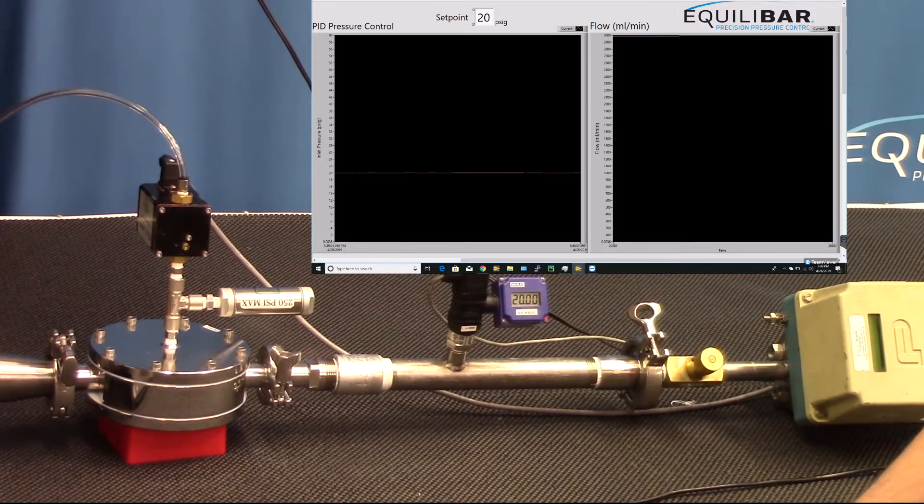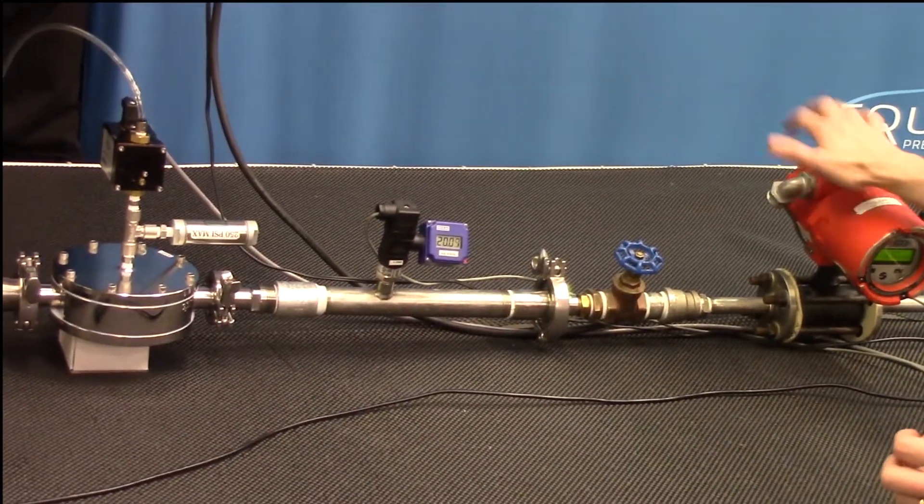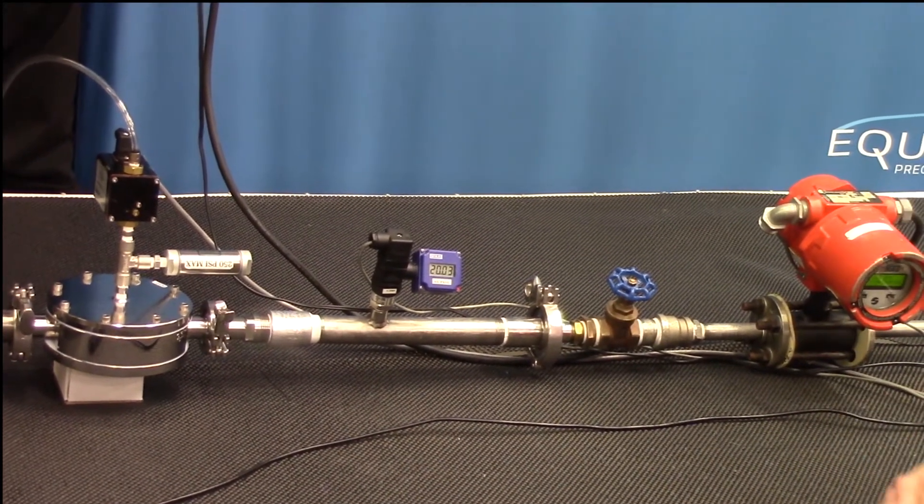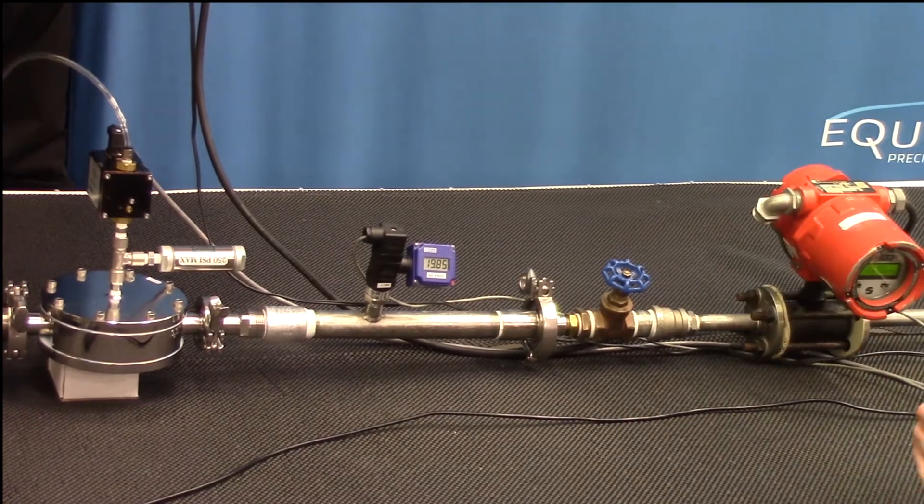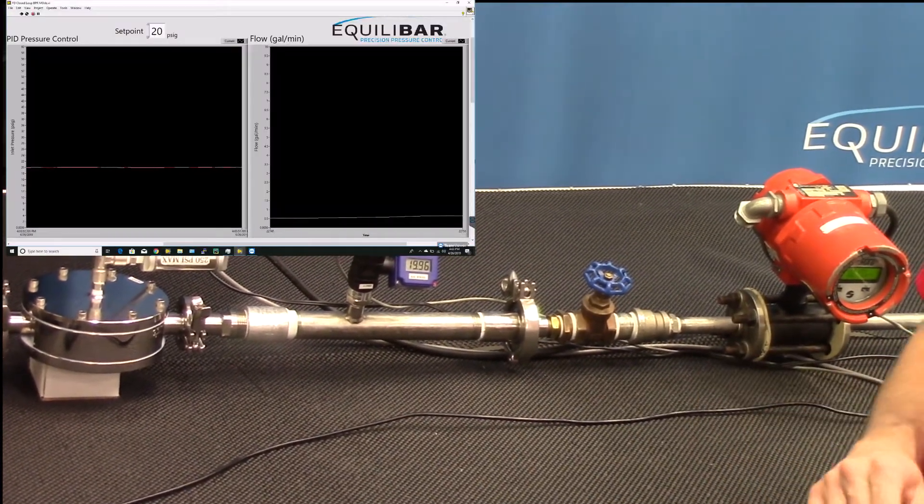Let's now change to a higher flow meter to see even more turndown. All right, so now we've changed the flow meter to a higher flow capacity. This measures flow up to 10 gallons a minute. Where we left off from the last segment, we were flowing at three liters a minute, which is almost 0.8 gallons per minute.